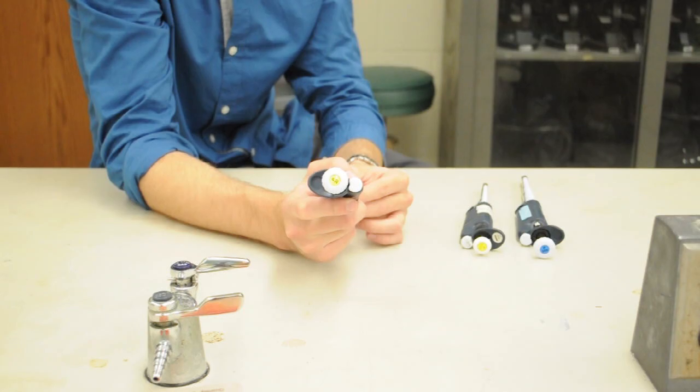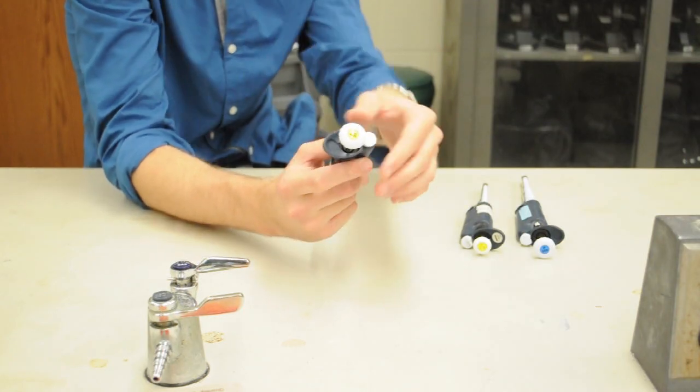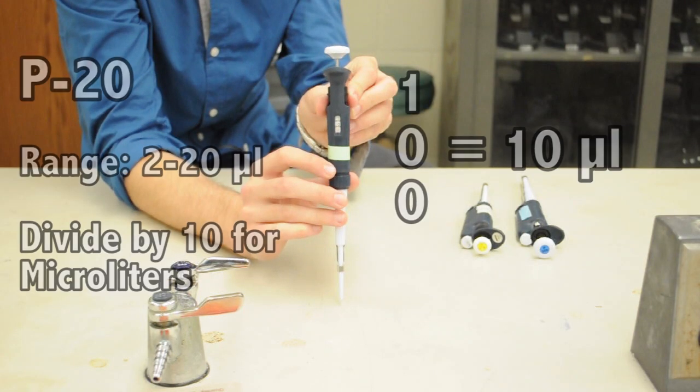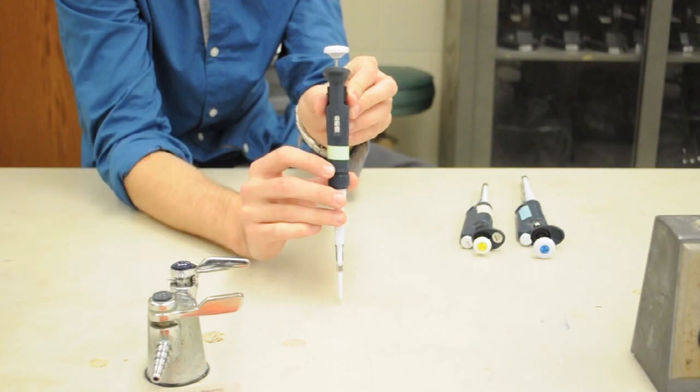We'll first take a look at the P20 and how to read its volume setting. It has a range of 2 to 20 microliters and you divide the 3 digit number by 10 in order to get the number of microliters that you'll be dispensing.